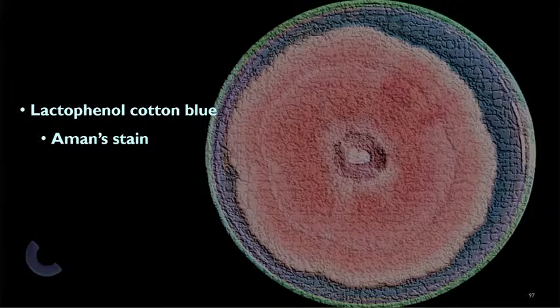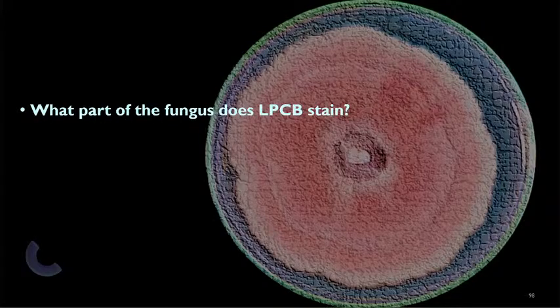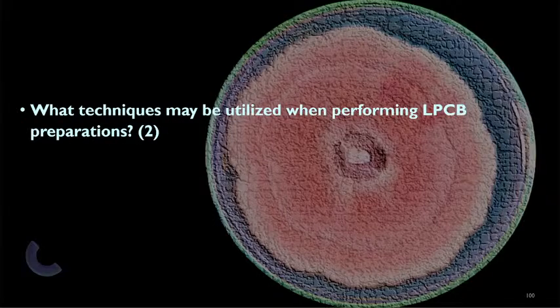Usually, they will have a checkbox. It's fungal elements. Usually, the fungal elements included is yeast cells, hyphae, and conidiospores. Tapos may panggulo doon na bacteria. Wala namang bacteria. Okay? Kasi hindi na-stain ng lactophenol cotton blue ang bacteria. Okay? So, clear? Clear tayo doon? So, if you're planning to take ACP, okay? Usually, yan yung mga questions nila. What is this? Okay? Ganun lang yan. Okay? Now, so we're back with what is stained. So, fungal, it stains blue.